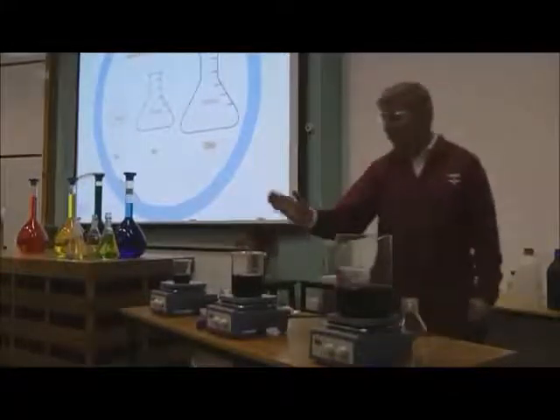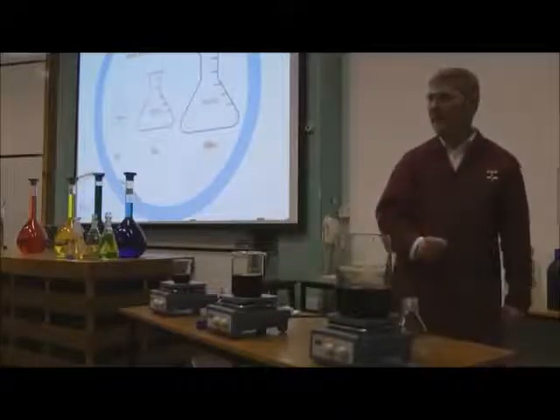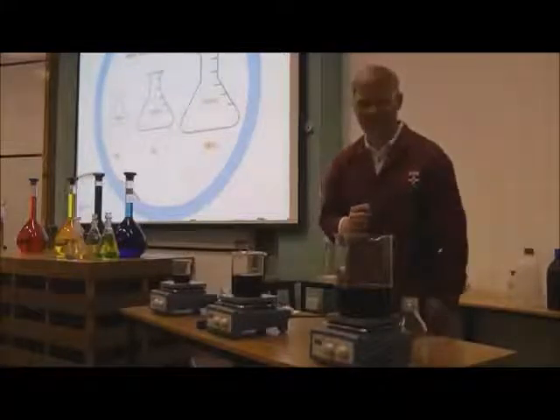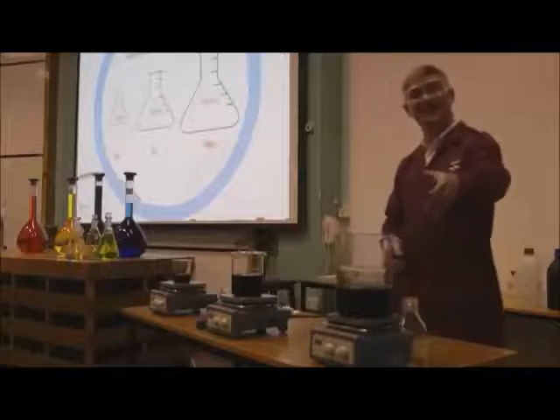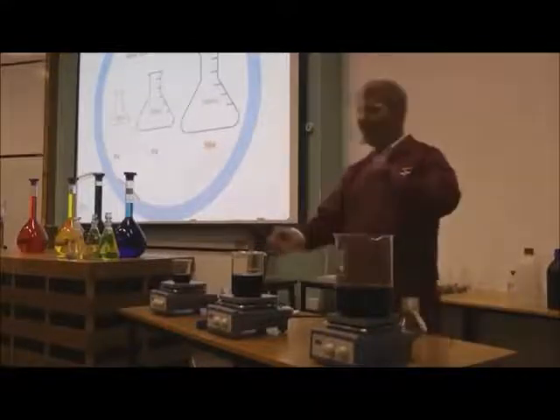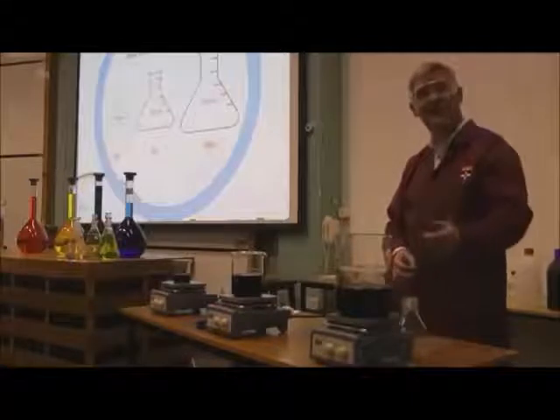Anybody got any idea why it went 1, 2, 3? Somebody at the back. Perfectly right. You may have noticed it's about the same amount of time as it took to pour the last bit in. There was only 50 ml going in here, it's straight in, reacting. 125, a bit longer, 250, a bit longer.